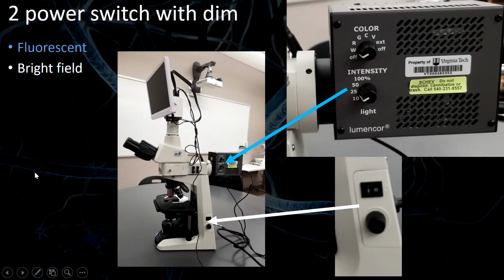Because there are two light paths, there should be two power buttons, right? Yes, there are two power buttons, and both of them are dimmable. So here is the fluorescent power button. You can see there's off, and then you have a choice of different colors. You can have white light, red light, green light, cyan, violet light. And you can change the intensity of the light. That's the fluorescent power switch.